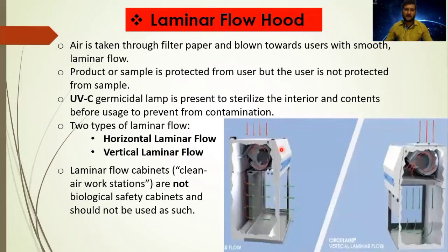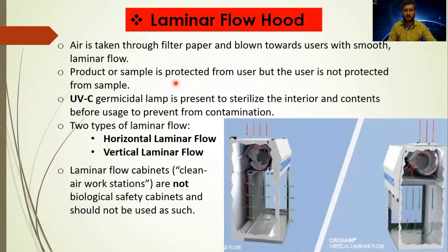Laminar flow hood — as the name suggests — means a smooth, unidirectional flow of air. Air is taken through the filter paper and blown towards the user smoothly. The product or sample is protected, but the user and the environment are not protected — this is its biggest drawback. It also contains ultraviolet light of category C, which helps germicides easily sterilize the interior. Before using the laminar flow hood, the UV light is switched on for 15 minutes to remove internal contaminants.